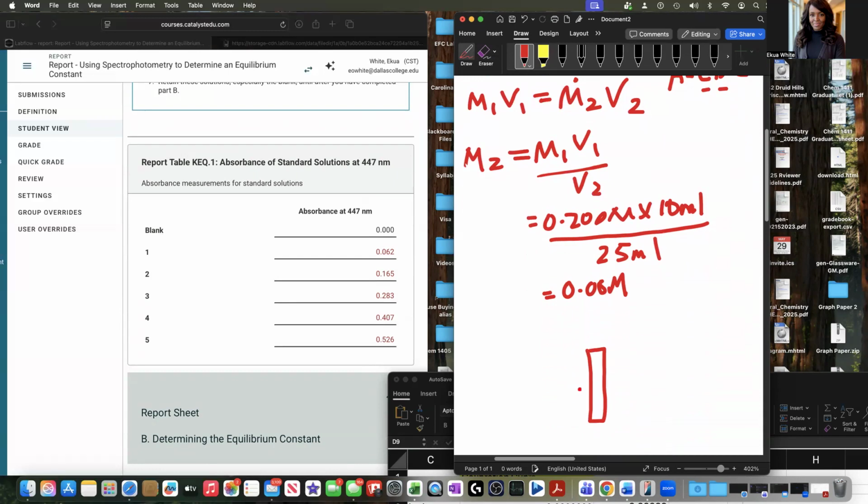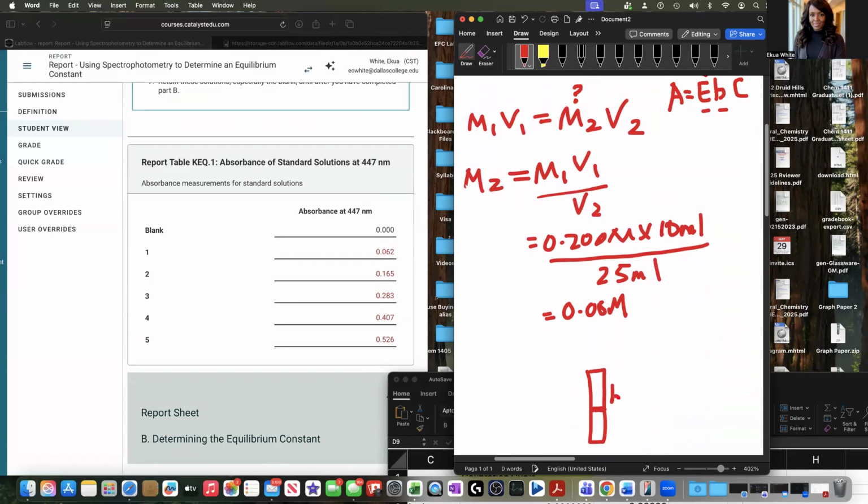So we're trying to figure out how long that light is in the solution, the distance traveled in the solution. That is the path length, the thickness of the cuvette, and that will be the symbol B. Since the cuvette is standard, B can be figured out by just knowing what the cuvette is. Long story short, from Beer's law, absorbance is proportional to concentration. So if the absorbance goes up, we expect the concentration to be higher.